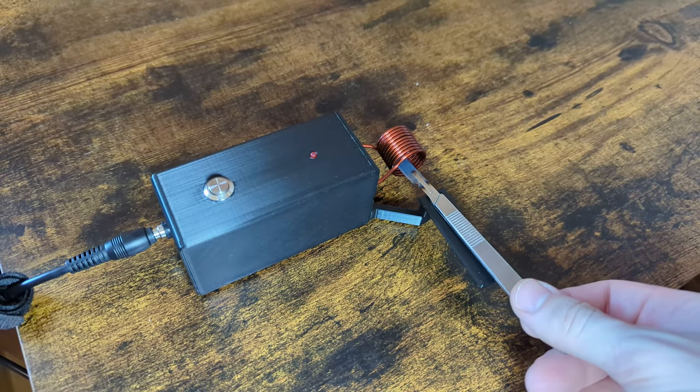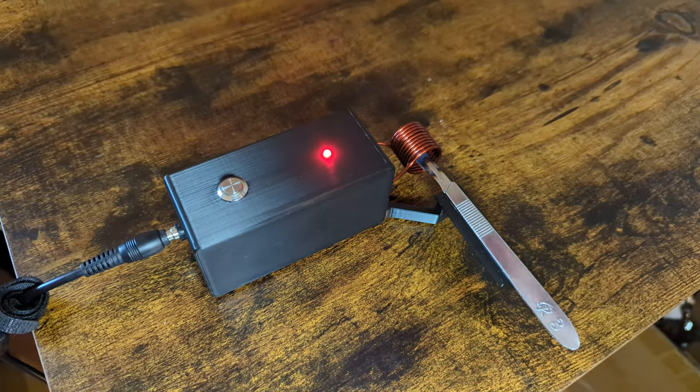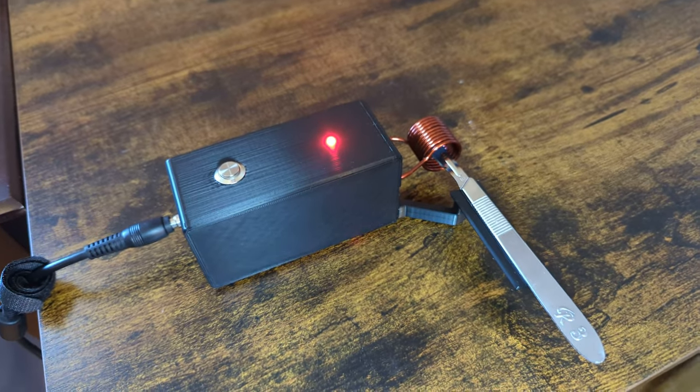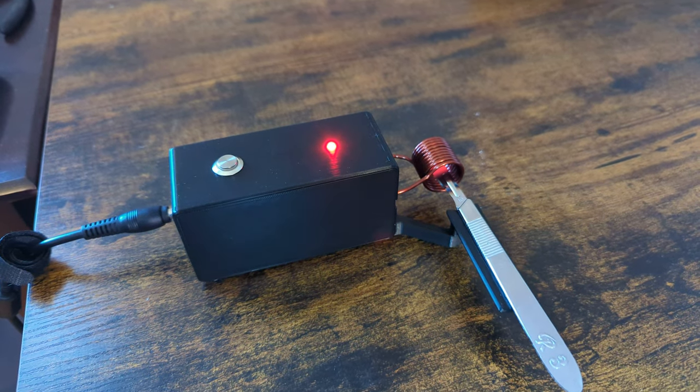Simply put it in on the scalpel holder. You can press the top button and it will activate for 10 seconds, getting your scalpel red hot, and it will automatically turn off by itself.